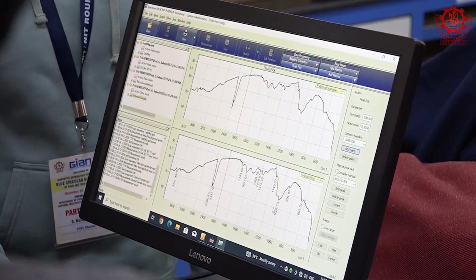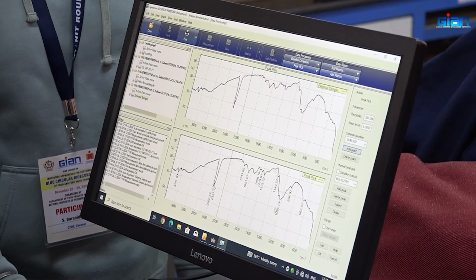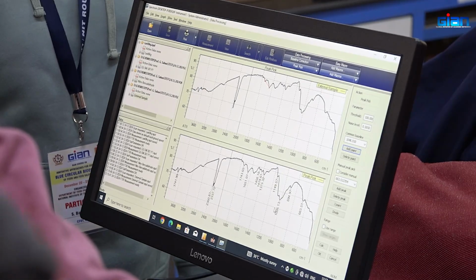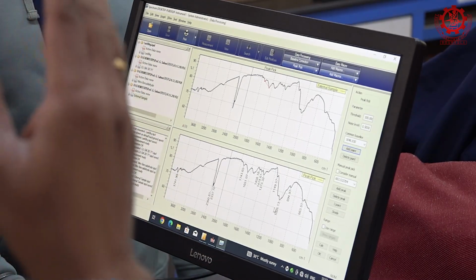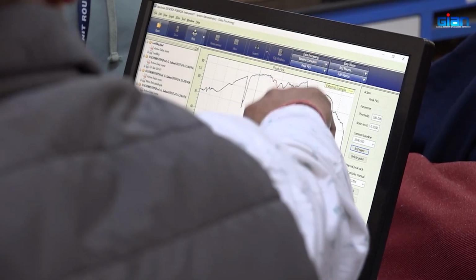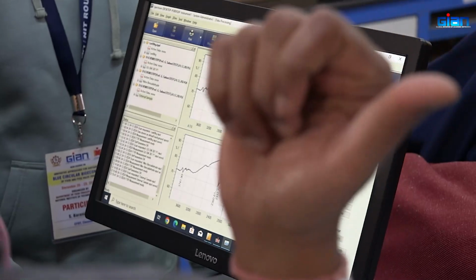But again, to understand this, you can always control the concentration, maybe take a dilute compound, okay, find where it is soluble, make it very, very dilute and see if you can get sharp peaks. But at least we are getting something around 1651, 70, because he was telling it is acetyl.